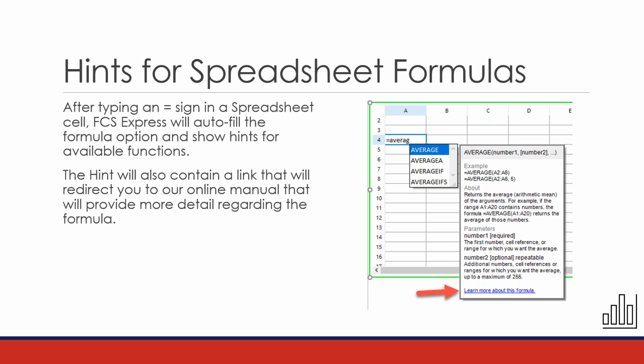You know, we've had many clinical labs where they were analyzing their data in whatever software they had with the instrument. They were exporting statistics from that, and importing it into a spreadsheet template that would report the data, only to find out that if there was any statistic that was off, maybe they were missing a statistic, or maybe another statistic was added, it just threw off the whole spreadsheet template that they were trying to use.